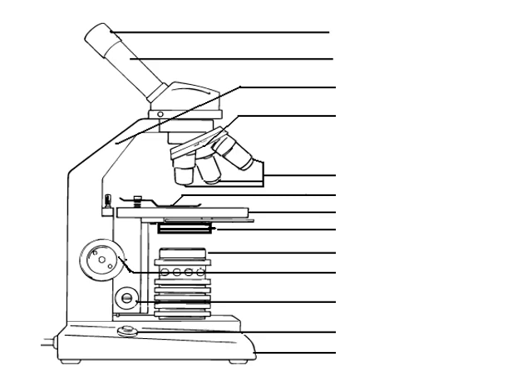So this is a simple picture of a microscope. It's called a compound microscope because we're going to be using two lenses in order to magnify the specimen. If we had more time, we would go through the development of the microscope. It started way back with people just making lenses for glasses, and then they realized they could examine things underneath the microscope. And then there was a whole big industry way back in the 1600s of lens making, and one guy who's called the father of microscopy is Anton van Leeuwenhoek. He was a Dutch lens maker, and he sort of invented the first simple microscope.